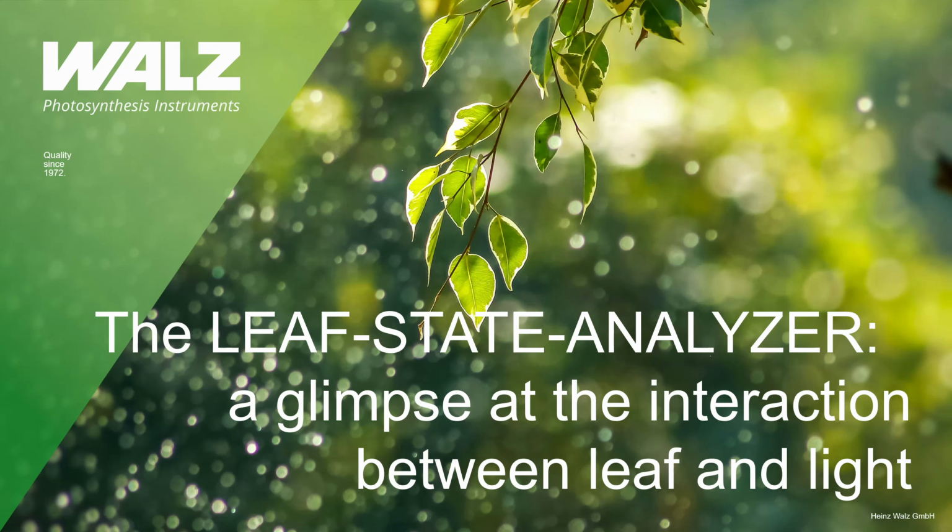With the instrument, it is possible to obtain information on the optical properties of the leaf in the form of leaf angle, screening of different wavelength domains, and chlorophyll content. These optical properties directly and indirectly affect the photosynthetic activity. To link these properties to photosynthesis, the parameter Fv over Fm is determined. In this respect, the instrument complements PAM instruments, which purely measure photosynthetic activity without consideration of the optical environment.